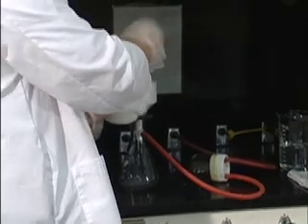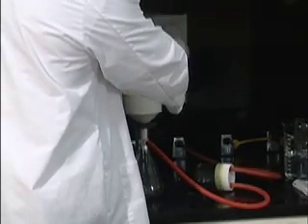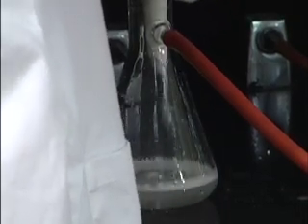You might want to poke a little bit of the fluid through. And simply pour all of the crystals into the funnel. Now Sherry's done a really good job here, so we should have an awful lot of crystals. It does look very crystalline.